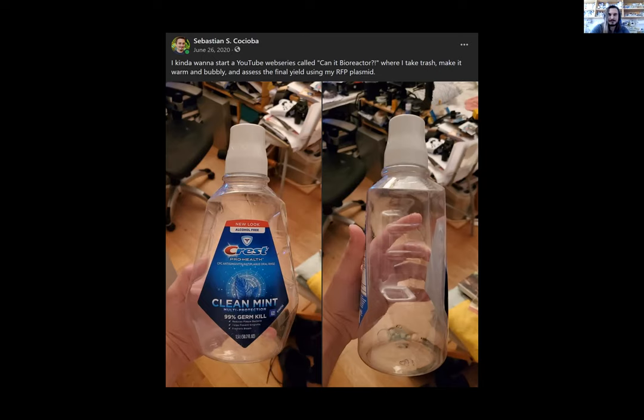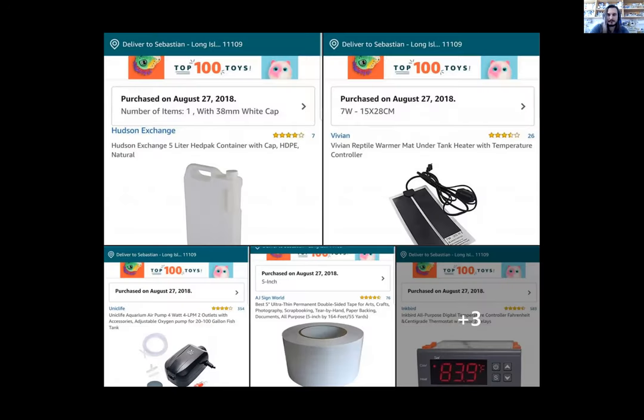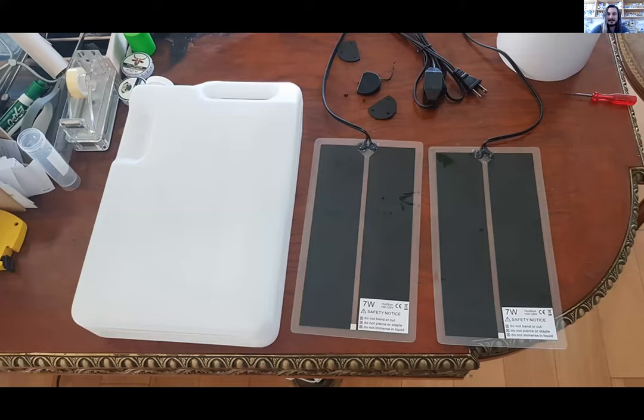So I went on Amazon, I started shopping around, and I started cobbling together a little shopping cart. And the most important thing I found was this 5-liter carboy that is like 2 inches wide and flat. I'm like, this is perfect. I have these reptile heating lamps, sorry, heating pads, from when I used to own a snake, that I could just glue onto the side of it, tape it down, put in an aquarium bubbler on a thermostat and call it a day. And so they came next day, everything was next day Prime. I was pretty excited for that.